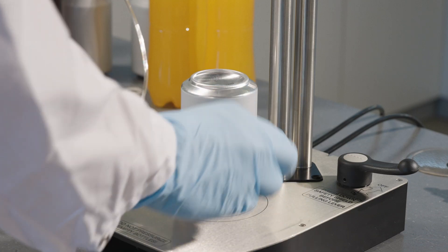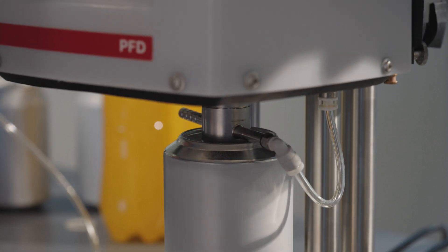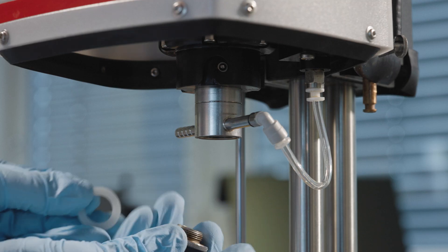Turn the can upside down, place it in the PFD, and lower the piercing head. For cans with deep bottoms, use the PFD spacer included with the device.